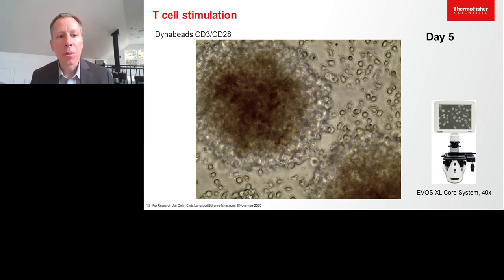And I find this valuable because you can actually see these without even a microscope being required. Just by eye, you can see these aggregates form, and it tells you that it's working. It tells you that our T cells are effectively proliferating. And we see this with natural killer cells also, or with even CAR T cells. We expect to see the same thing.